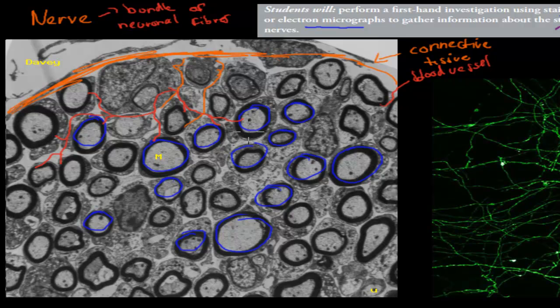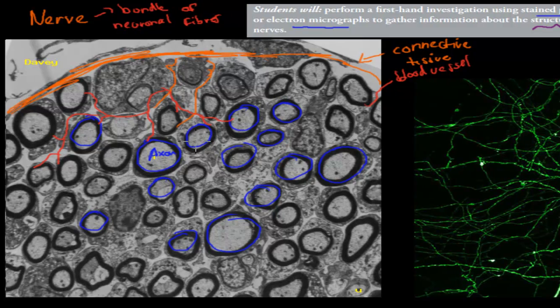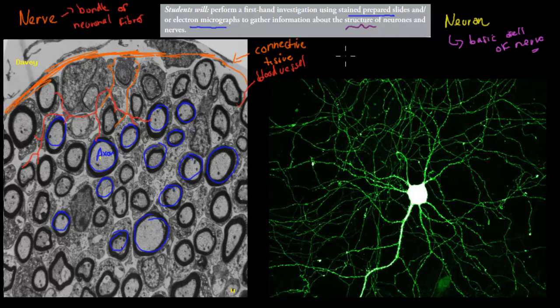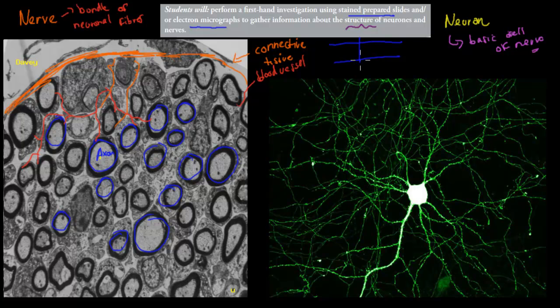Remember, what we're seeing here is probably the axon, that long tail. This is obviously a cross-section, which means if we have a nerve here, we're cutting it here and looking at it from there. We're not doing a longitudinal cut. So we're looking at it and we can see all these tails from different neurons. Each of these would be a tail of a neuron. So that's basically the structure of a nerve. I don't think you need to know more about structures of nerves than that.